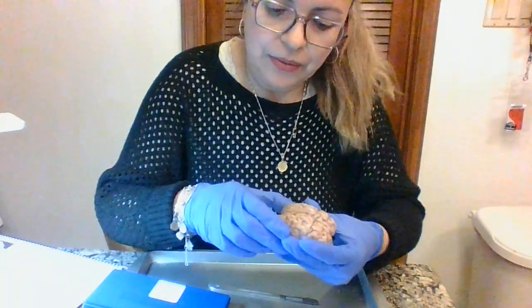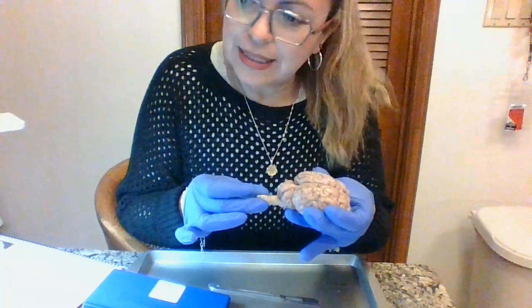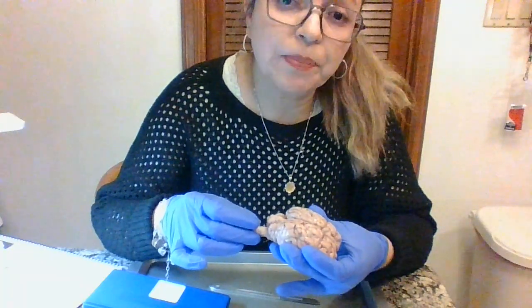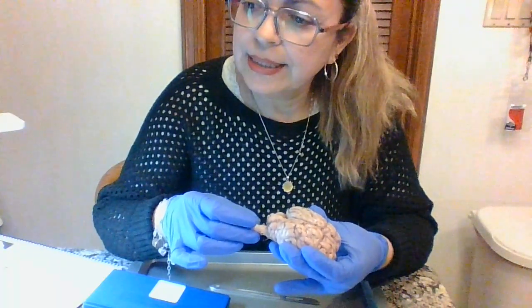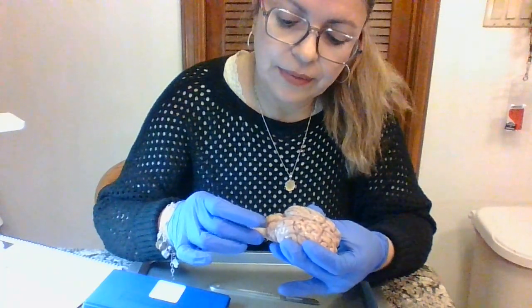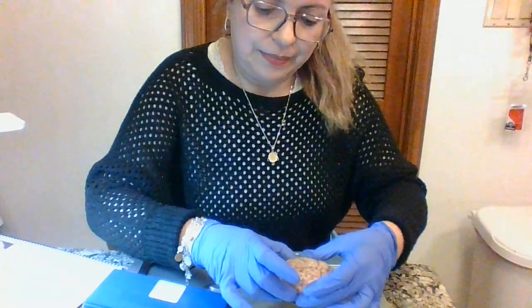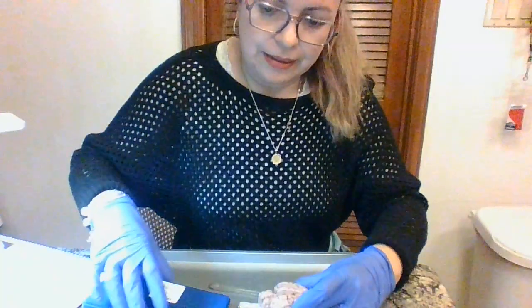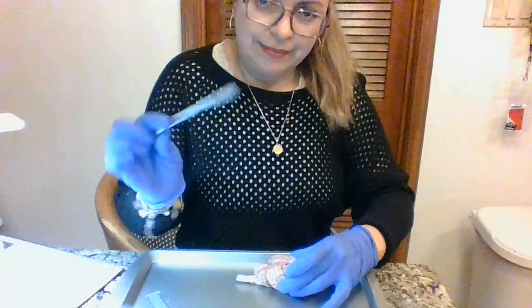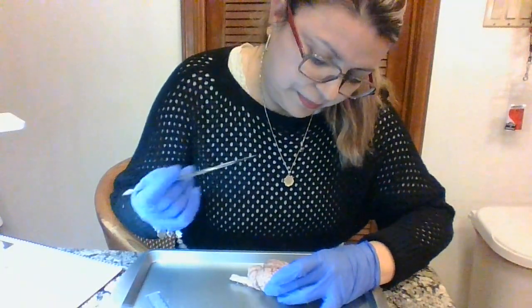Okay. Third, we have the spinal cord. The spinal cord is a crucial pathway that sends information from the brain to the body. Okay. Next, I have here my little knife to cut the brain.